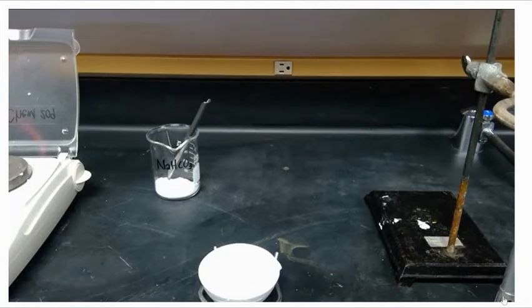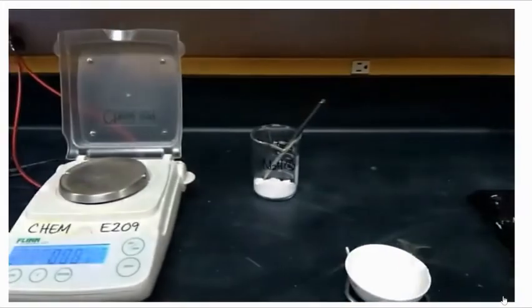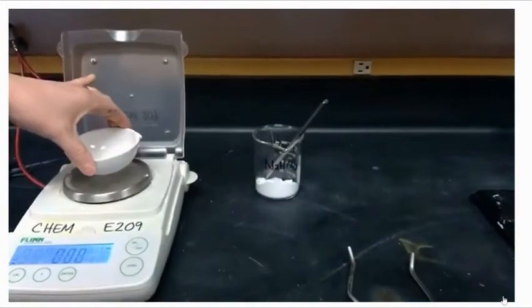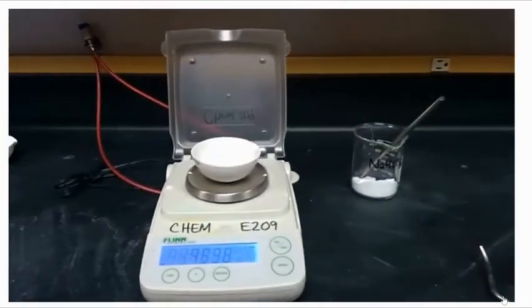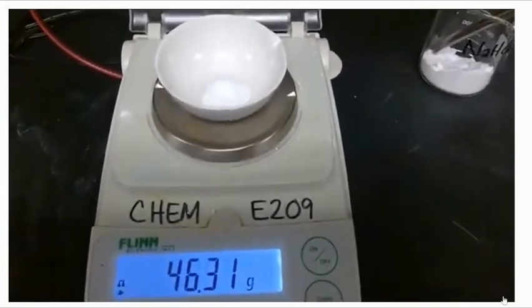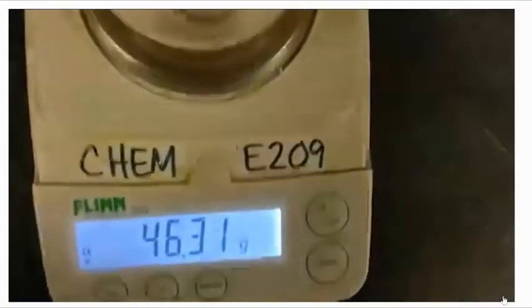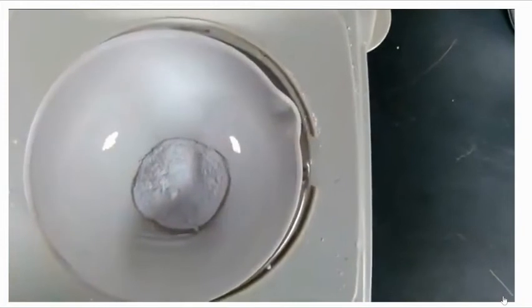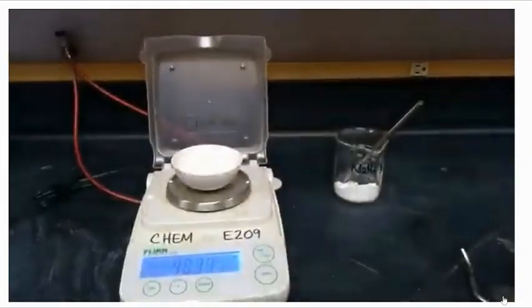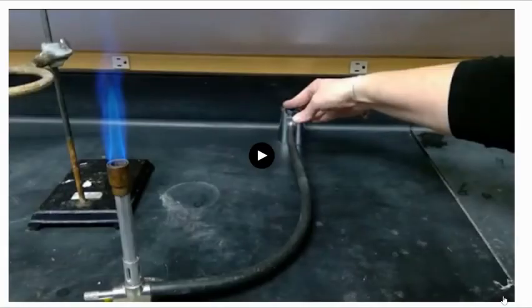Now that we've let it cool, we can gently check by just putting our hand over the top of it to make sure that it's not hot, and then picking it up and getting its final mass. We can see that the mass of the evaporating dish with product is 46.31 grams, and that product still looks like a solid white powder. Not much overt signs of a chemical reaction except that change in mass.